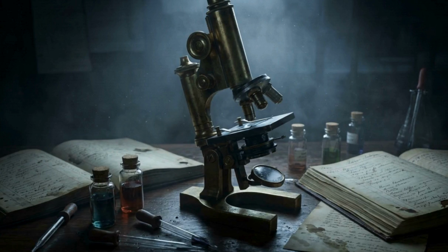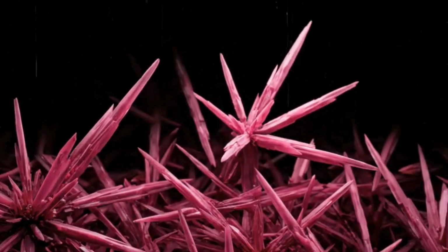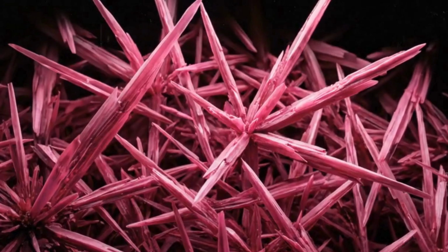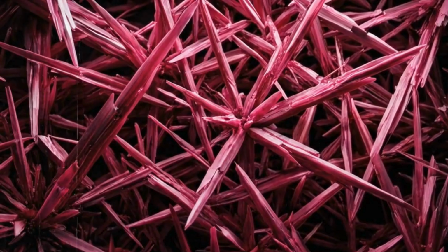To physically prove a sample is blood for the courts, forensic labs rely on a century-old technique called the Takayama crystal assay. By treating the suspected blood sample with a mixture of glucose and pyridine, the chemistry forces the iron inside the heme to form new chemical bonds. This physically alters the molecular geometry, building out a rigid, bright pink crystalline structure.